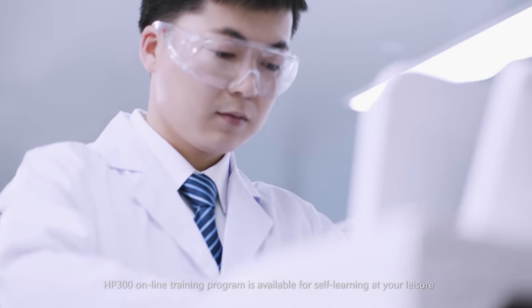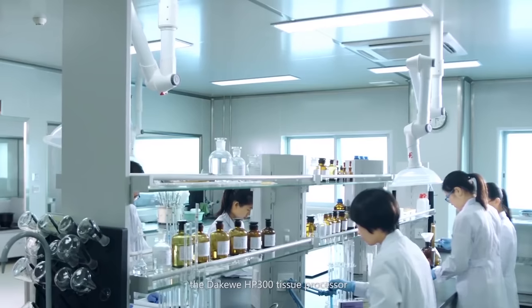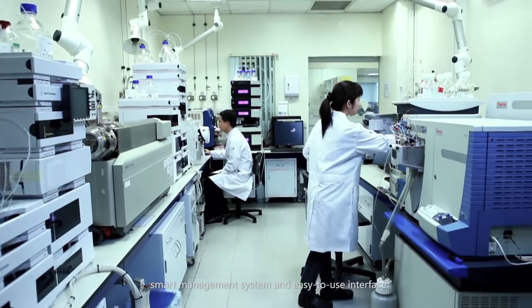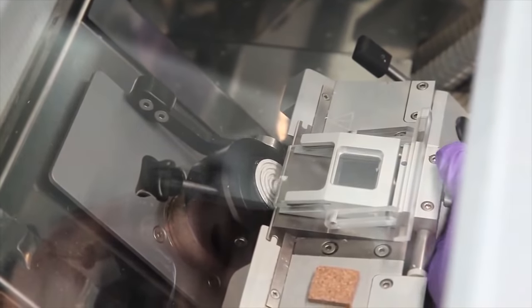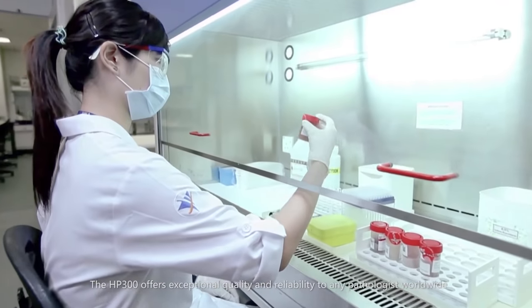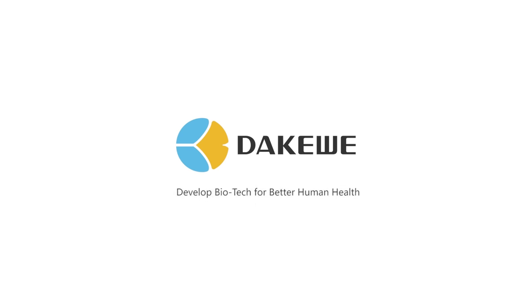The HP300 online training program is available for self-learning at your leisure. Today, the DAKWAY HP300 Tissue Processor, due to its unparalleled stability, smart management system and easy-to-use interface, is being used worldwide in hospitals, universities, research institutions, third-party laboratories and other organizations and industrial sectors. The HP300 offers exceptional quality and reliability to any pathologist worldwide. Develop biotech for better human health.